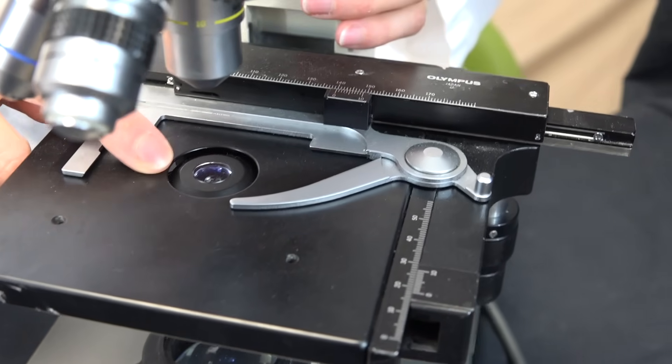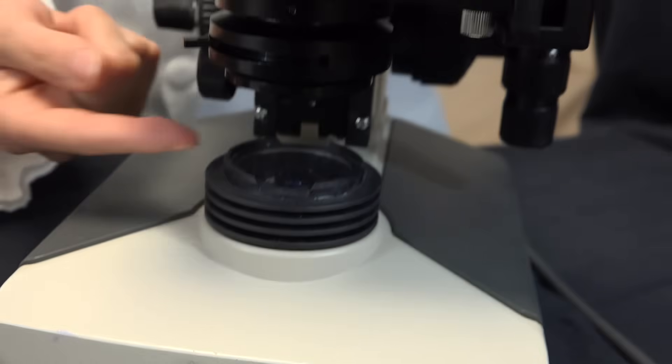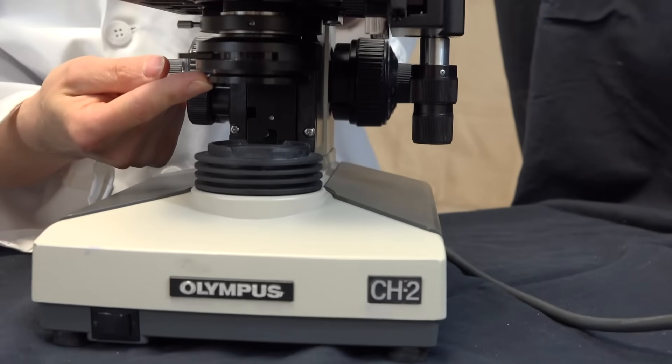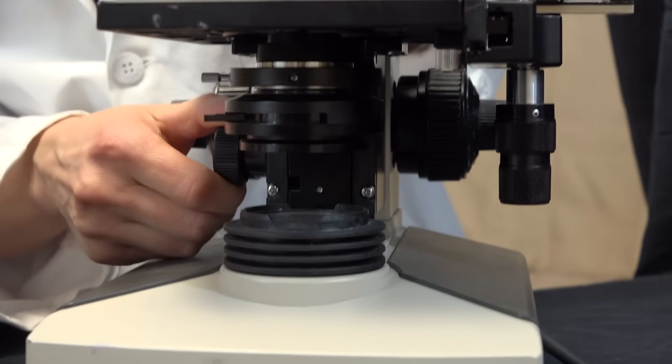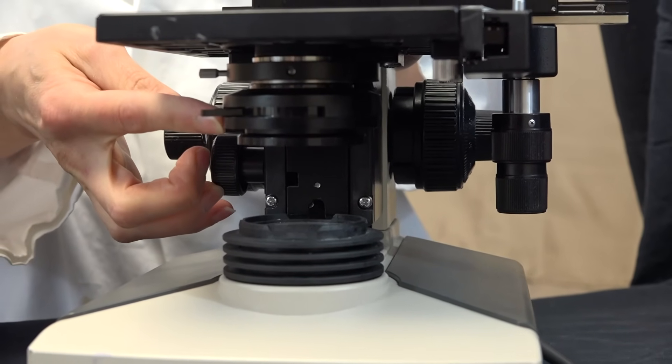In the center of the stage there's a hole and underneath this hole is the condenser. If we look underneath the stage, you see the condenser is up here. The condenser can be controlled and moved up and down, but for most applications all the way to the top is the best position.